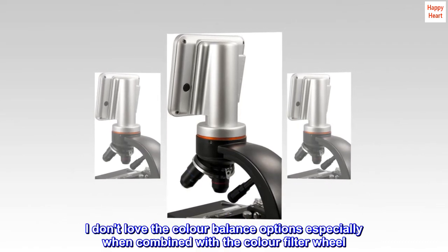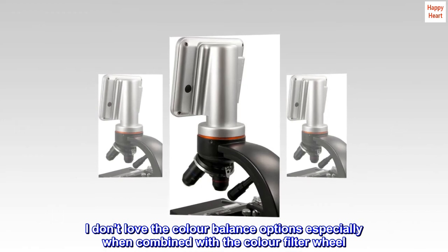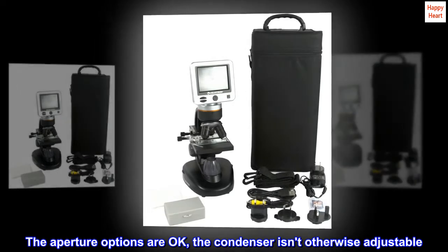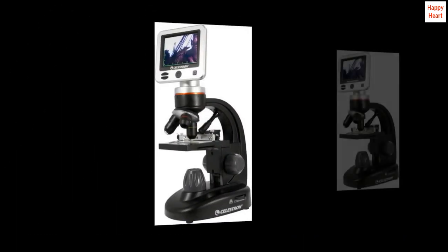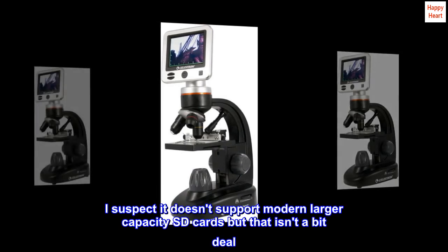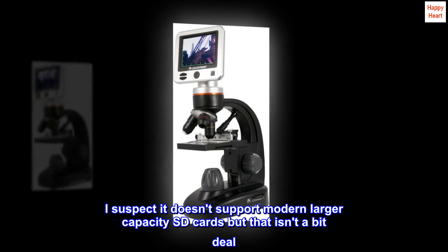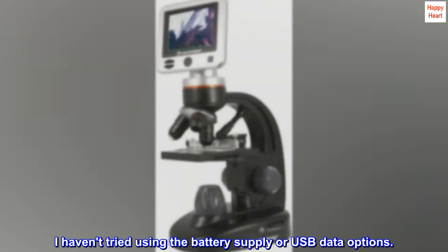I don't love the color balance options, especially when combined with the color filter wheel. The aperture options are okay, but the condenser isn't otherwise adjustable. I suspect it doesn't support modern larger capacity SD cards, but that isn't a big deal. I haven't tried using the battery supply or USB data options.